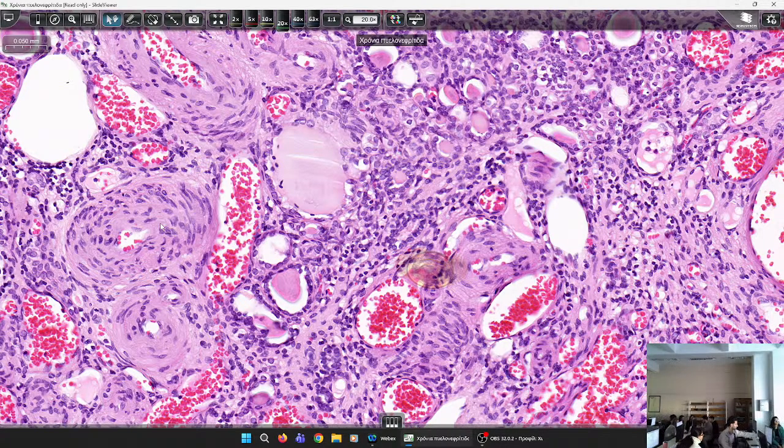That's right. It's chronic inflammation, because due to the chronicity of the inflammatory exudate, the lymphokines secreted by the lymphocytes cause the obstructive endarteritis. That means in chronically inflamed tissues, the walls of the vessels become thickened.